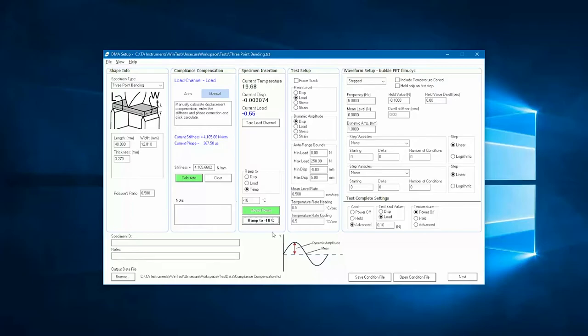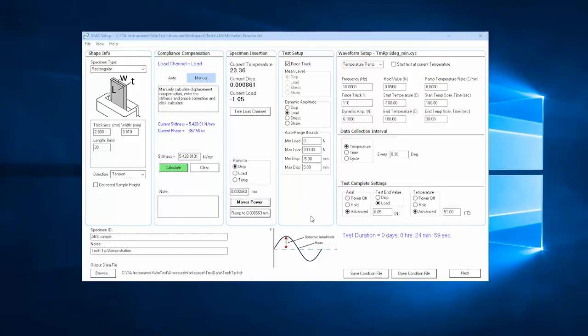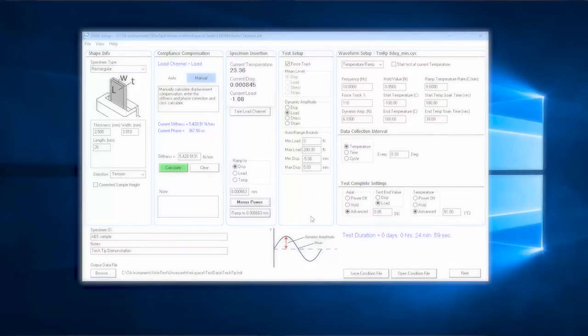For fixtures that mechanically clamp onto the sample, such as tension grips, the tightening of the grips onto the sample may induce compressive load or a slight buckling of the sample.